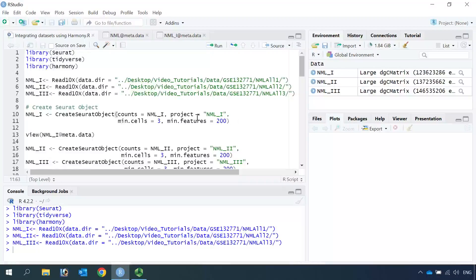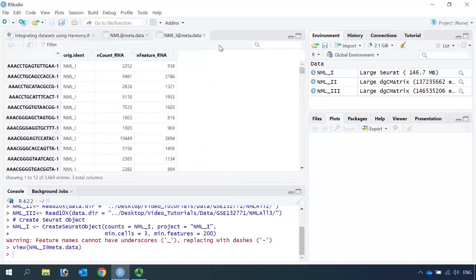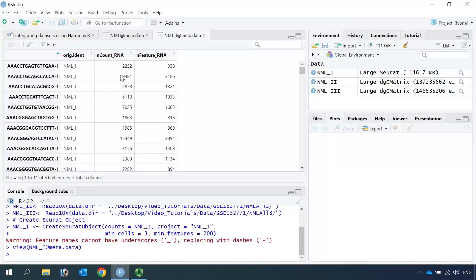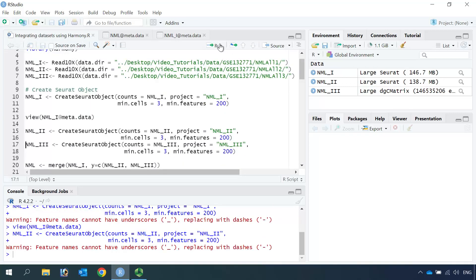Importantly, we use the project name NML1 for the first dataset — this is important for batch correction. Let's create the first Seurat object. Then we can have a look at the metadata for NML1. You can see the row names are the cell barcodes, we have the orig.ident NML1, and we have the nCount and nFeature RNA.